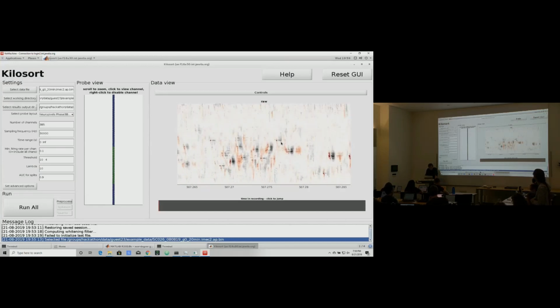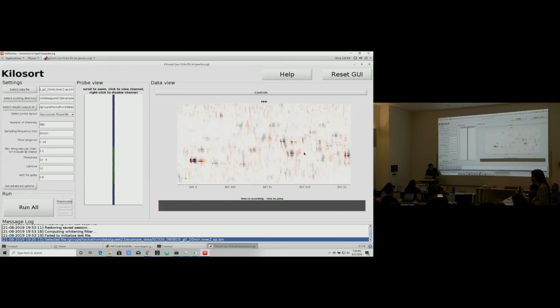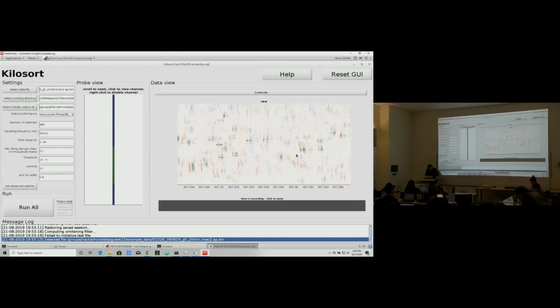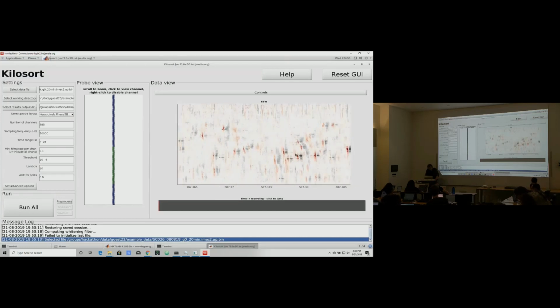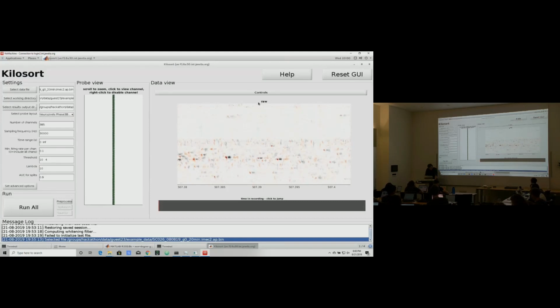So it's big firing rates, right? Lots of overlaps. This is going to make spike sorting hard because we can see lots of situations where spikes are overlapping. So we'll go through that and we'll see how well ks2 can do in this situation. And I guess if that's the thalamus, then if I zoom out, at the top where there's no spikes, I guess that's got to be cortex then.